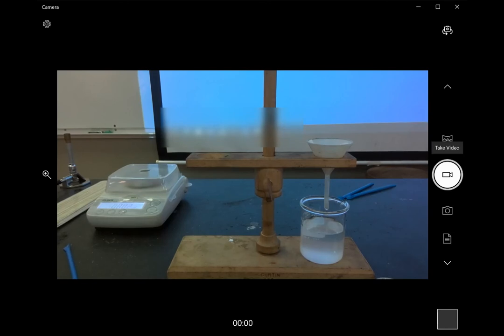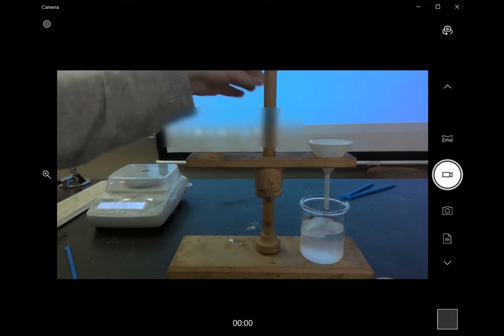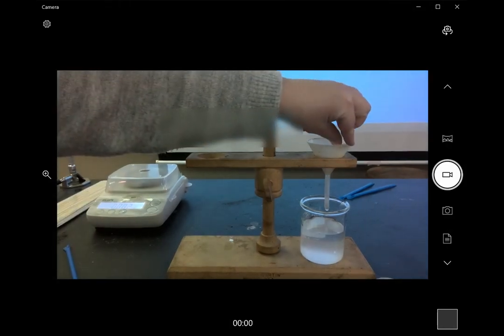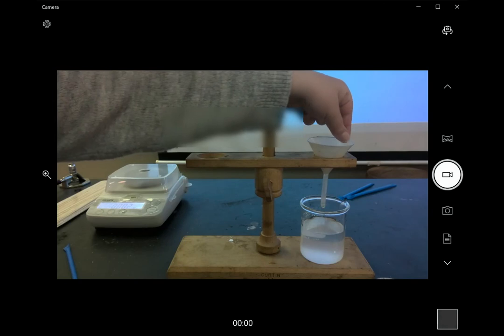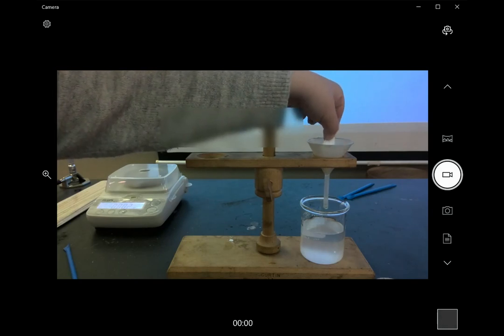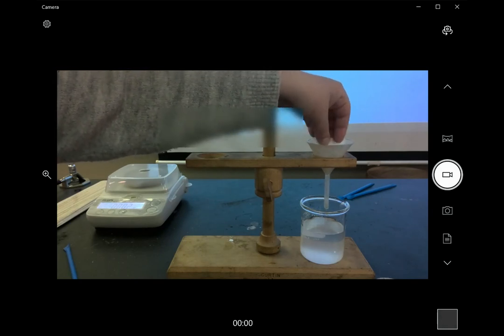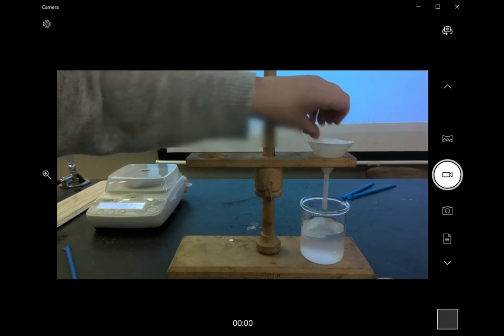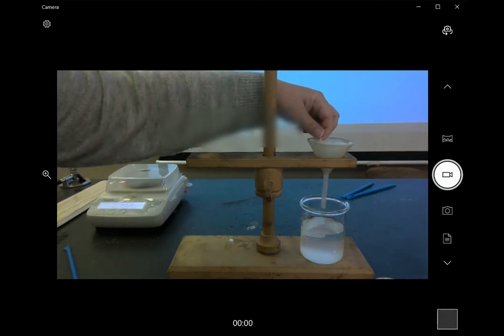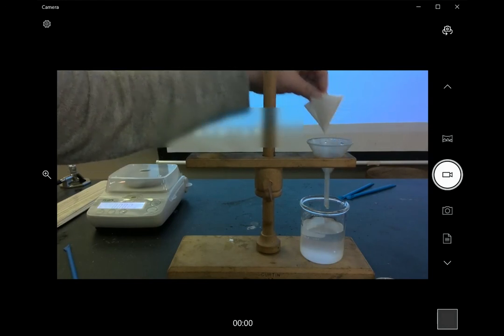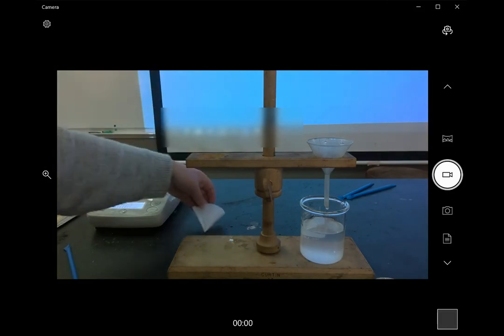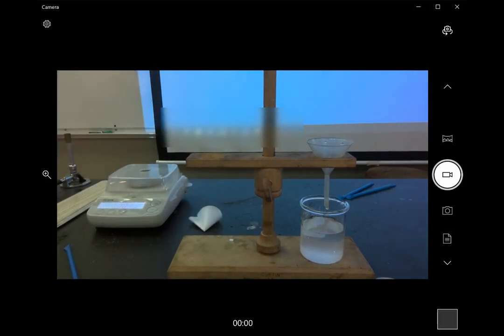And then once the water has filtered through and we don't have any more drips, we can just pull the filter paper out of the funnel and leave it to dry. We'll come back tomorrow and mass it once it's dry to see what our actual yield was and compare that to our theoretical yield.